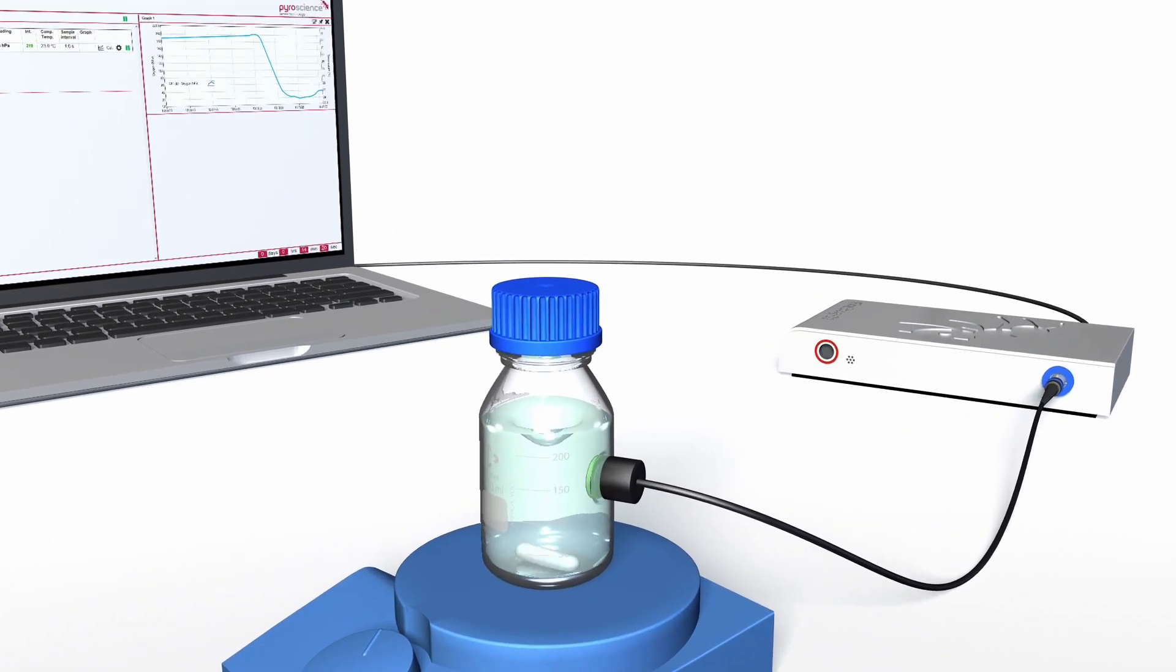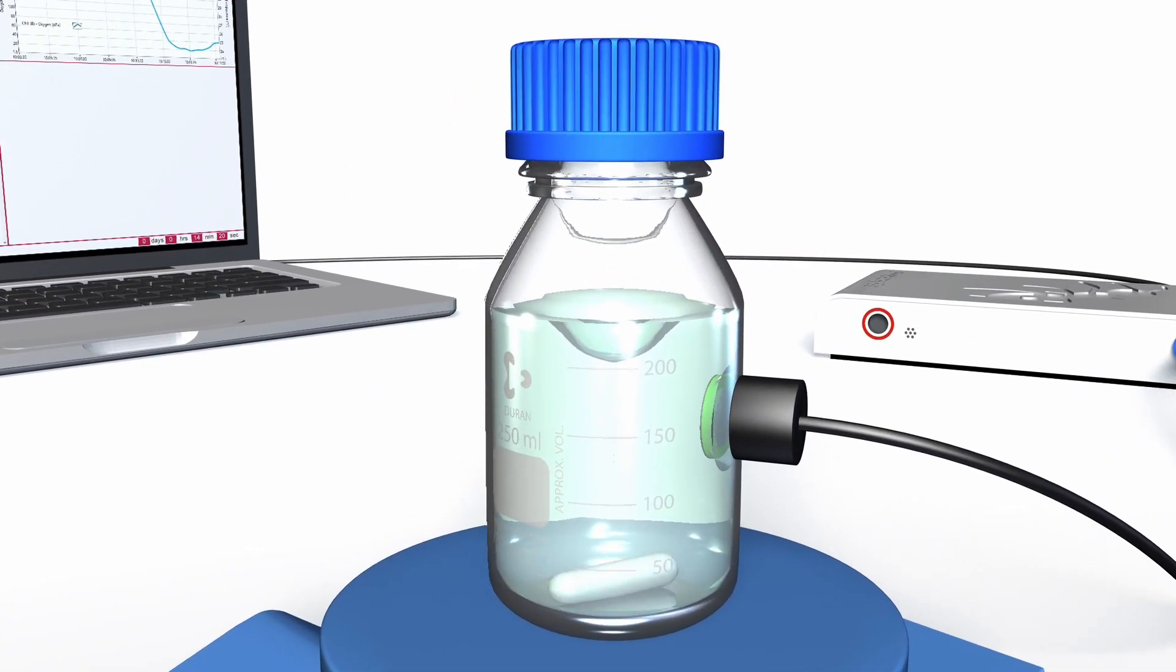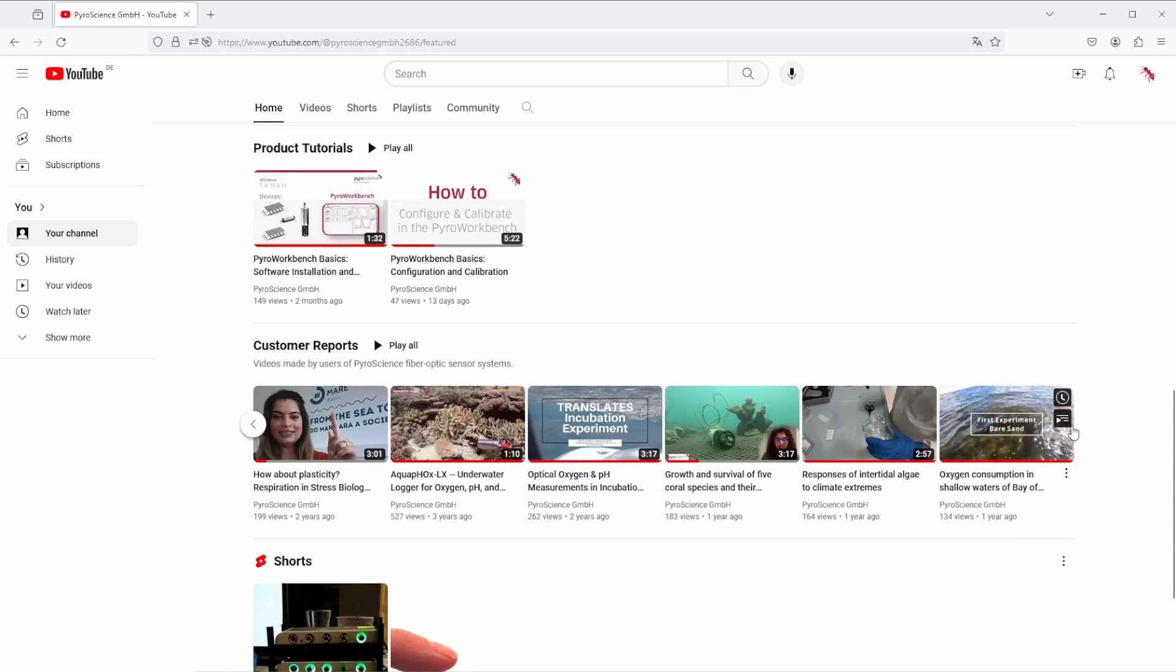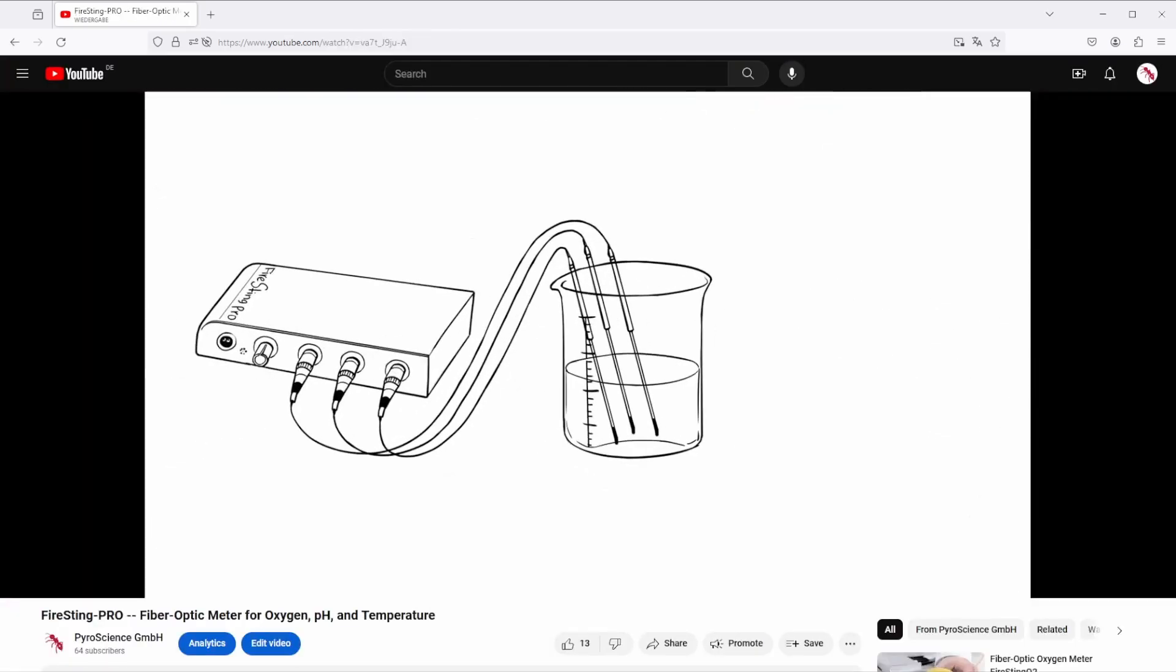The readout fiber can now be connected and measurement started. Watch our latest video or check out our YouTube channel for customer reports, guides and product showcases.